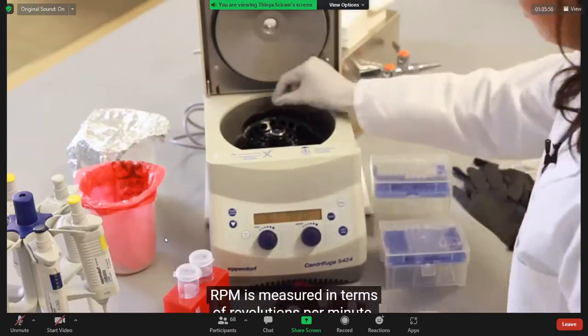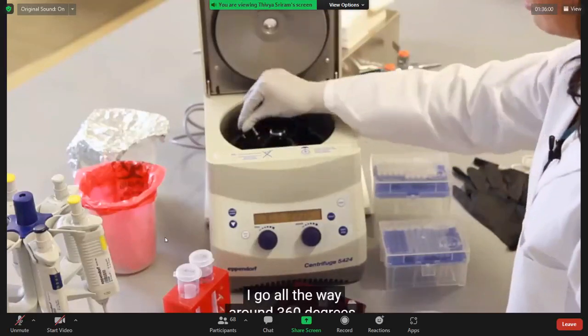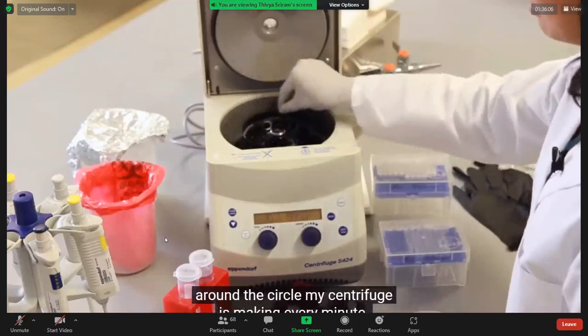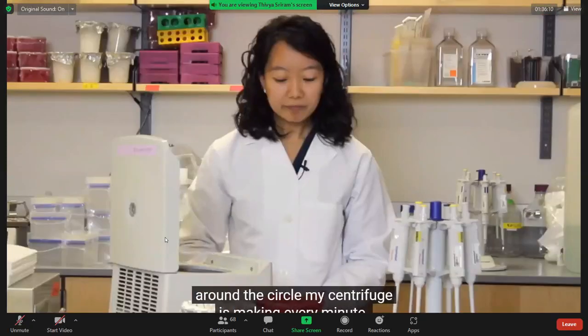RPM is measured in terms of revolutions per minute. So if you imagine I start here on the circle, I go all the way around 360 degrees, that would be one revolution around my circle. So RPM is really just measuring how many revolutions around the circle my centrifuge is making every minute.